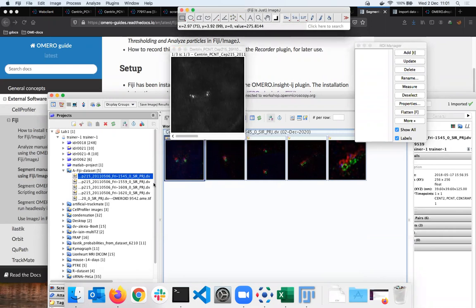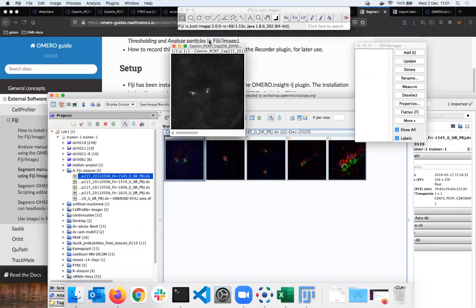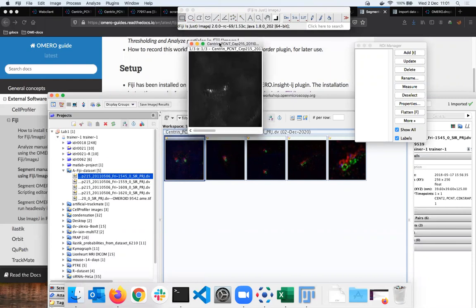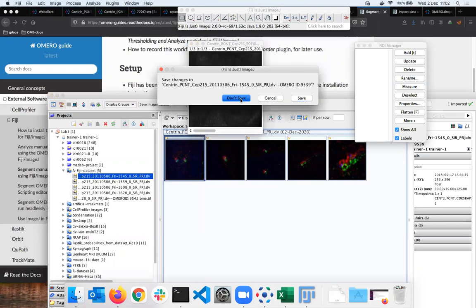I have 4 of them here in this data set, but they are coming from a bigger bunch of images coming ultimately from the Image Data Resource, IDR, where there are 414 of them, and they are connected to a scientific publication. Very good. I can go now and say, type 8-bit, okay. Thinking about which, I actually want to go again and show you how to be more proper.